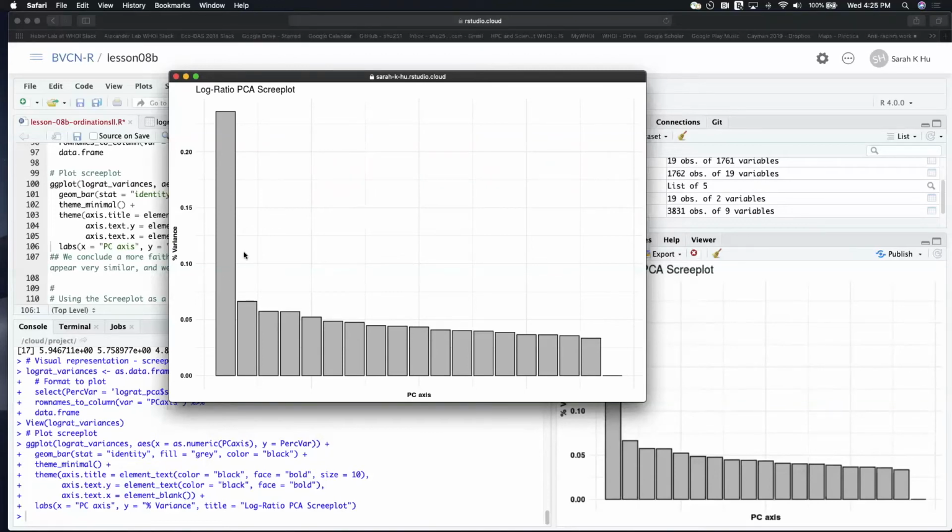What I'm taking from this, to give you insight into what I'm thinking when I see this, is that for my data, the first axis is pretty good. It's showing a fair amount of variance among all my samples. But the second one doesn't show a whole lot of the variance among all of my samples. The third one is really similar, and all the subsequent ones aren't too different from the second axis. So if I plotted this in the PCA in 2 dimensions, it's only going to show the variance that's summed in these two, and so I have a lot of variance that is left unexplained.